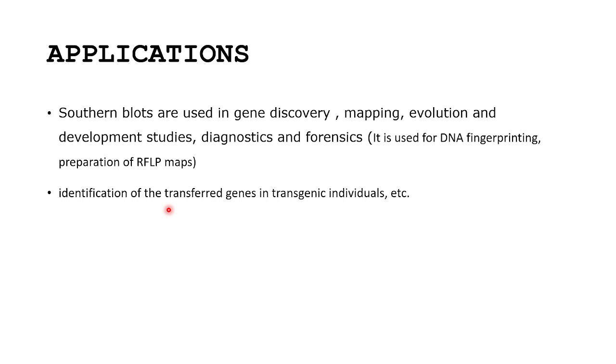So now the question is why do we even use blotting? We can directly see it on a gel. Yes, but there is a mixture of different fragments. So there can be several fragments of the same size, of the same length, but varying in the sequence. So to identify the exact sequence where our desired product is, we need to perform Southern blotting, or any blotting, to appropriately tell where our desired product lies.